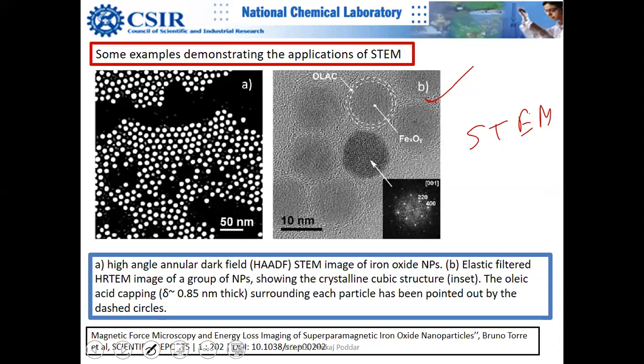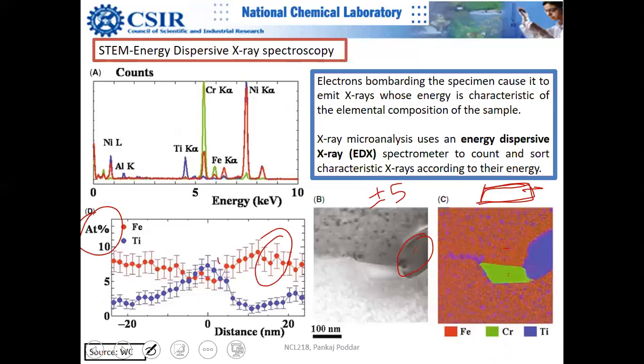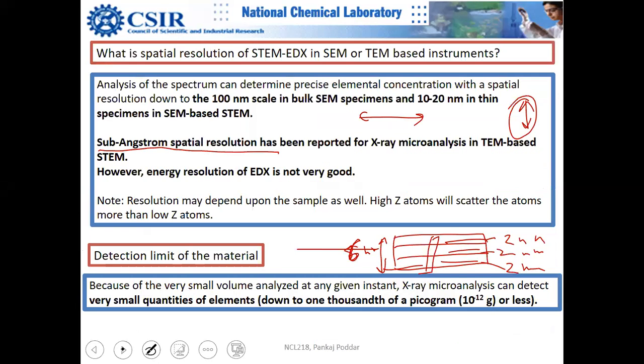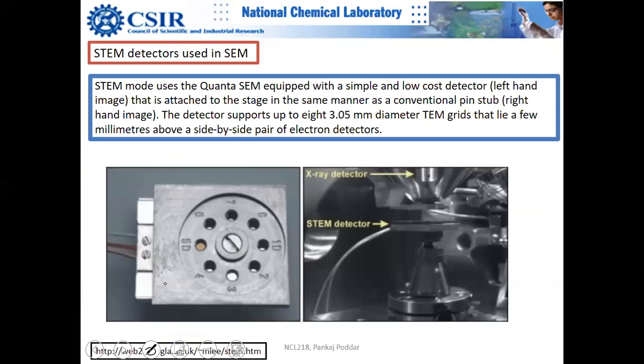So all this data, especially for photons, when you are collecting photons, you have this problem of collecting data from... Yes, somebody was asking this question. So you can, in an SEM machine. This is actually an SEM. This is not a TEM. Actually, you don't have much space in a TEM.